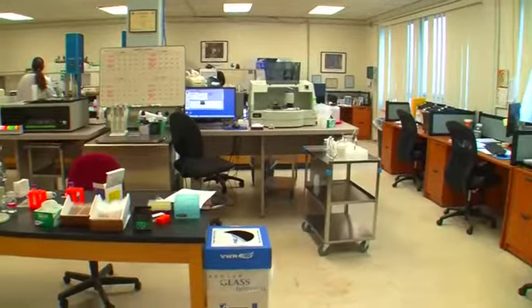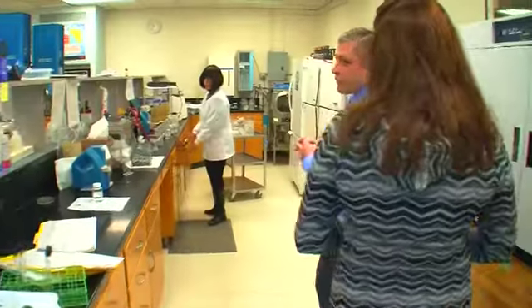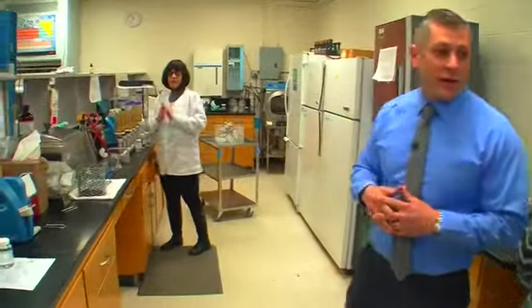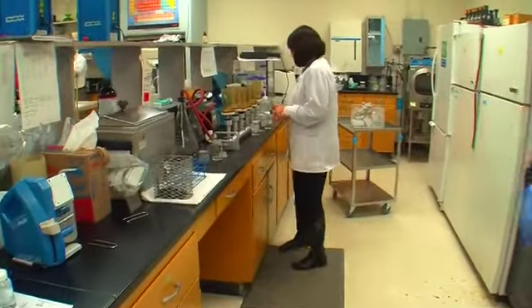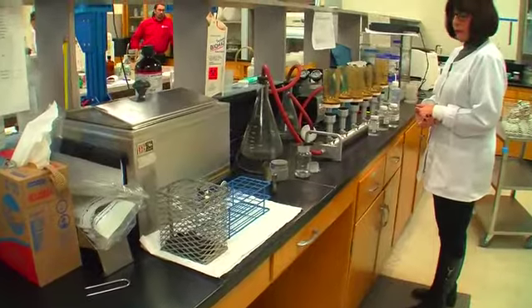Hi, Phil. Hi, Jill. Today we're in the laboratory where the Water Quality Department is charged with monitoring the water that goes through everybody's taps and into their homes and businesses. One of the primary components of our laboratory is our microbiology section. We monitor from various points in the distribution system every day to make sure that the water that we're providing meets all standards for total coliform and E. coli, and that is that they have to be negative.